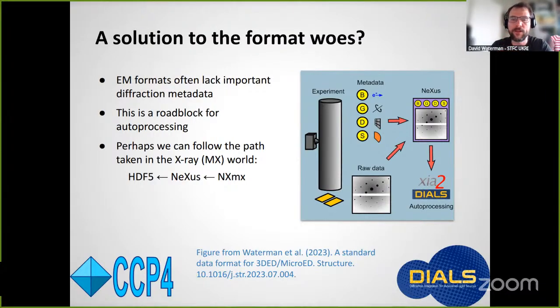And in the X-ray world, they've basically solved this. They've had committees who have met over many years to agree standards. And I don't want to join a committee. It doesn't sound like a lot of fun, but luckily they've done everything for us. So there's an NXmx standard, which describes diffraction experiments.